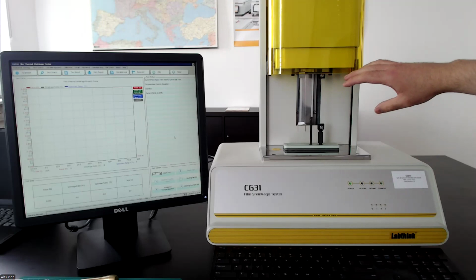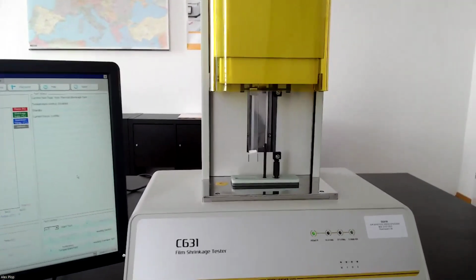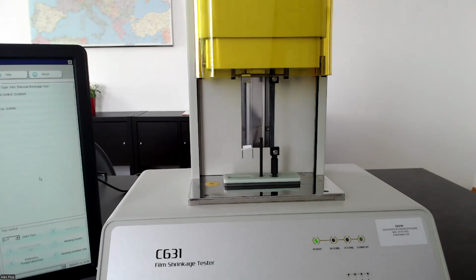Here inside, where we have the incubator or the testing area, we have two sensors. So we have the load cell. My colleague is helping me to get closer to it. We check the shrinkage force on the right-hand side, and on the left we check the shrinkage ratio, and we use an infrared sensor for this.